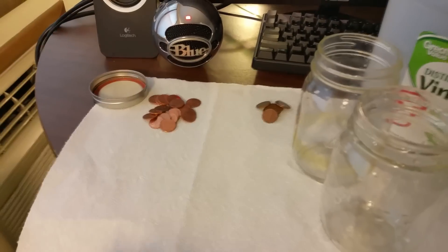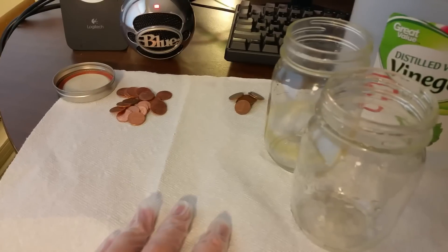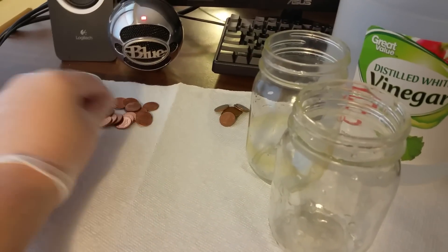Hi everyone! In the previous video I showed you how to make copper acetate using copper sulfate as a precursor element. Today I will show you how to make copper acetate from elemental copper — in our case, pennies.